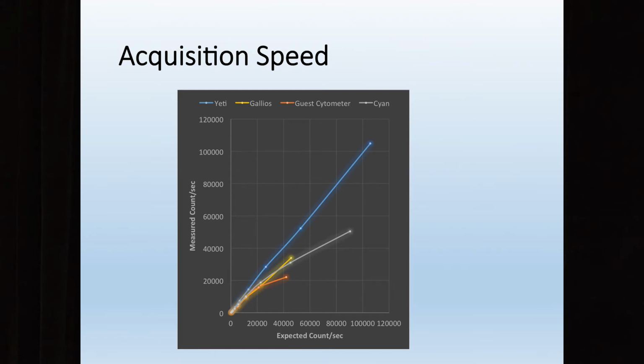As it is, I had to kind of make some gates for, okay, these are the doublets, obviously, and kind of add those into the calculations. But I don't know, Dan, I think it might go to infinity.